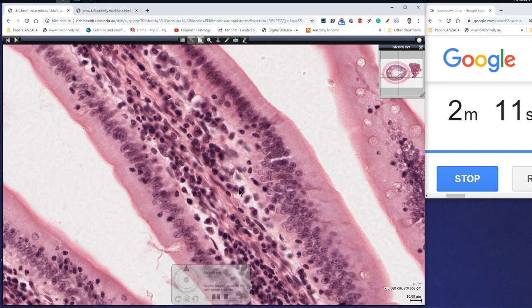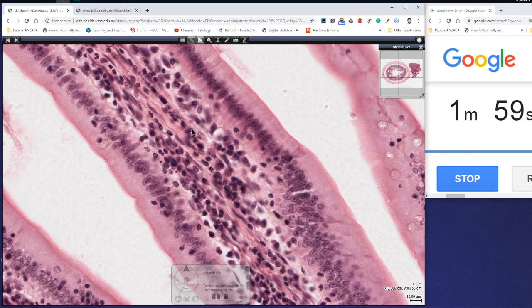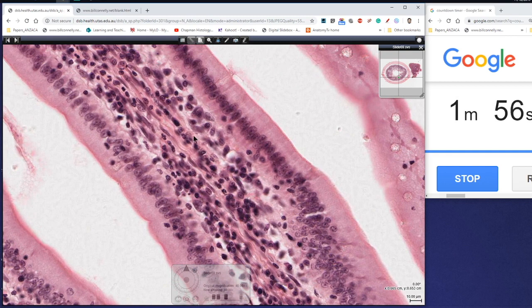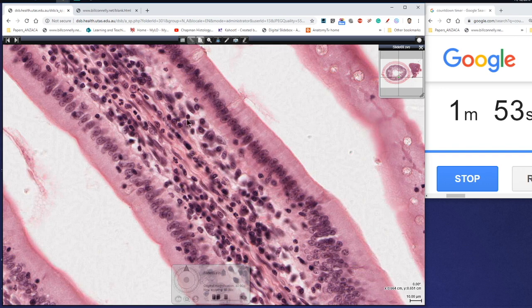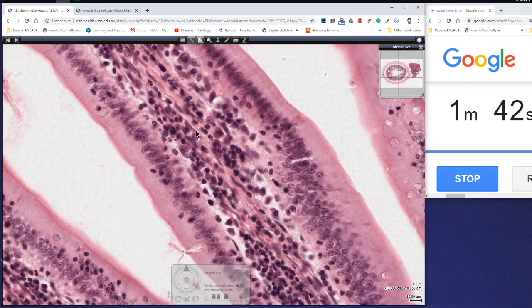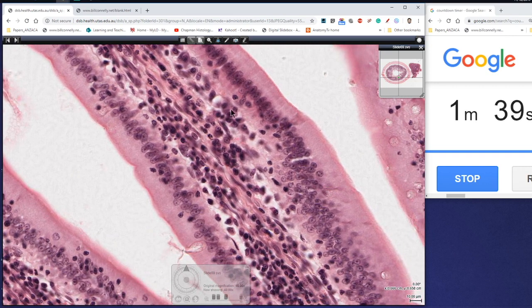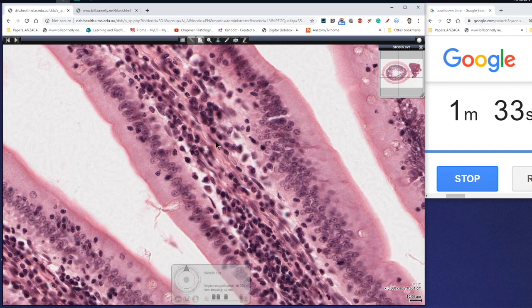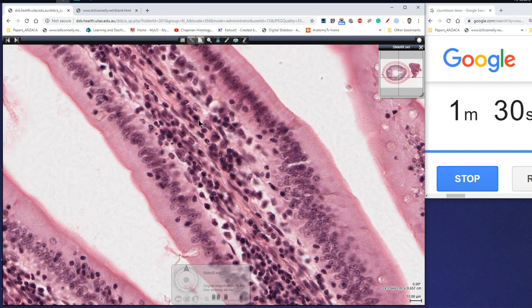The spaces we can see would generally be filled with ground substance — ground substance being largely water, which gets removed during processing for microscopy. There's not a lot of evidence of fibres here, but we can see lots of different cell types: lymphocytes with very little evidence of cytoplasm, larger cells that are probably macrophages, smooth muscle cells, neutrophils, and plasma cells — the ones with the basophilic cytoplasm — producing antibodies and so on.